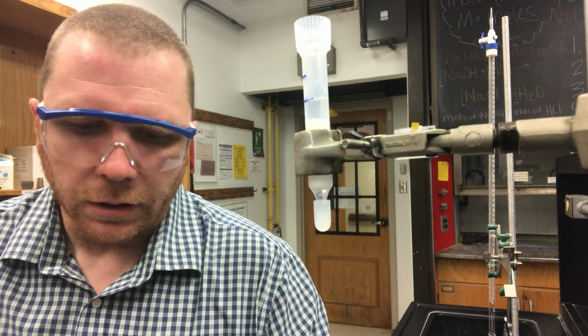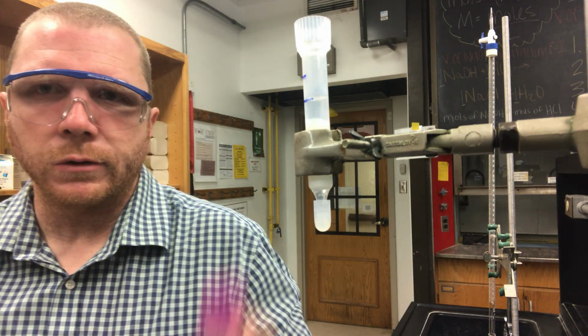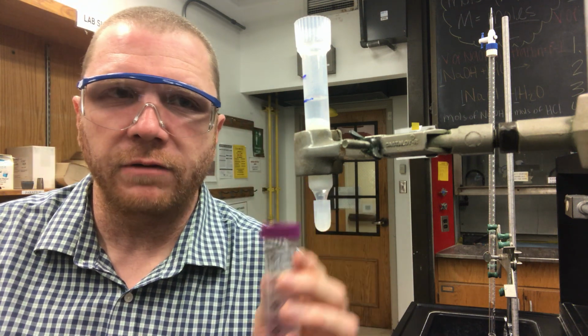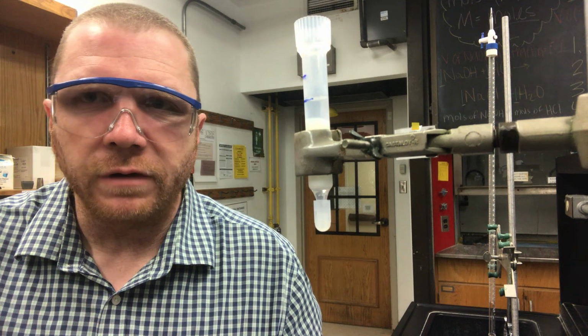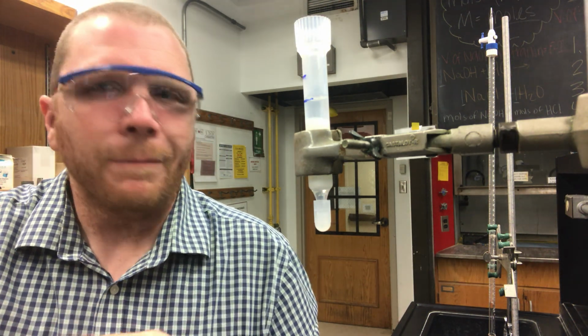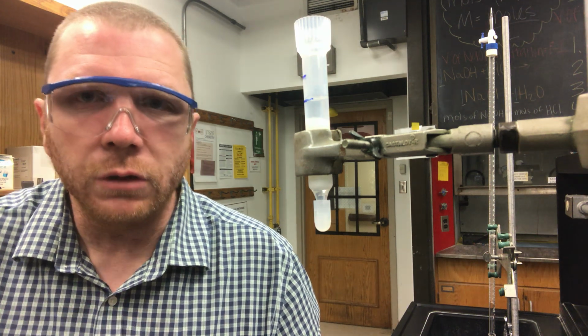So as you can see, I have a couple of things at my disposal. I have my sodium phosphate buffer, my wash buffer that does not have any NaCl. I have my chromatography column, and I have right here a transfer pipette. Now transfer pipettes may or may not be the best thing for you to use here.